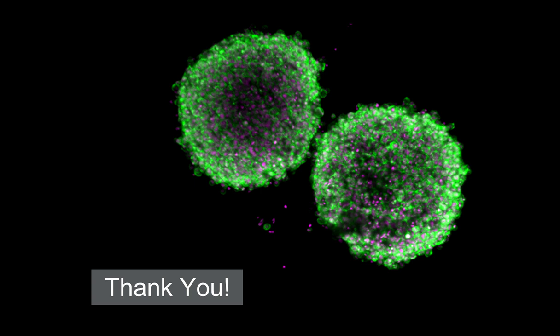Thanks, Christy. That's a great question. And so, imaging these thick structures, we do have to worry about photobleaching of our fluorophores and also the toxicity induced in our cells by exposure to excess light. So for photobleaching, we can use confocal imaging and limit our detection to a single plane of light. We can also use the mounting media that I showed, specifically ProLong Glass, that will preserve our fixed samples and prevent photobleaching or destruction of fluorophores in those models.